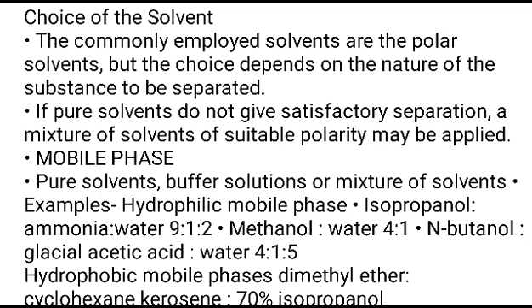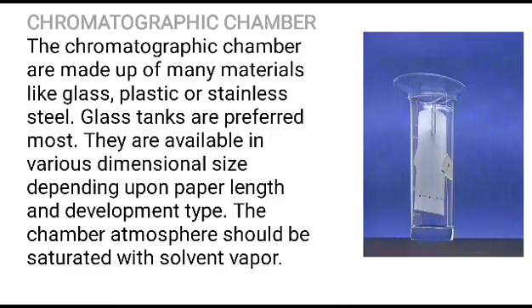These are the hydrophilic mobile phases. Now the hydrophobic mobile phase: generally dimethyl ether, cyclohexane, and 70% isopropanol are used as a hydrophobic mobile phase.